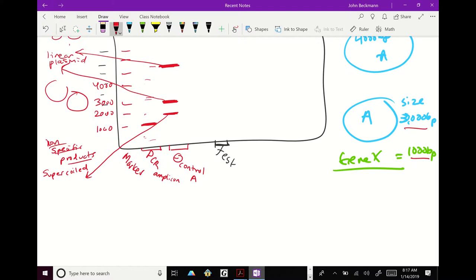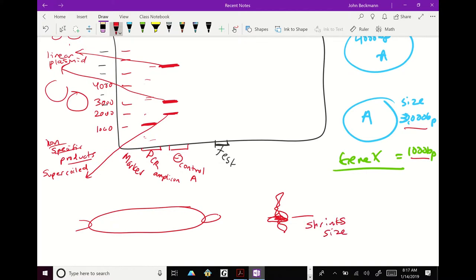So imagine you take a rubber band, which is like a plasmid, and you grab it here, and you grab it here, and you just start to twist, and you twist, and you twist. And what will happen is it will basically go like that, right? So you're putting a lot of tension into the DNA molecule, and the cells will do this, and it shrinks the size. So that's why you see it much lower, because it's a much smaller particle. So it can run through those pores a lot faster.